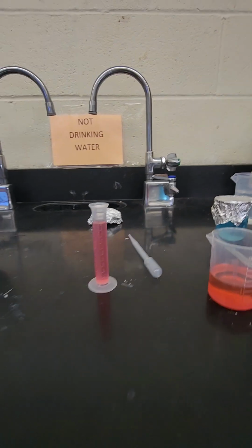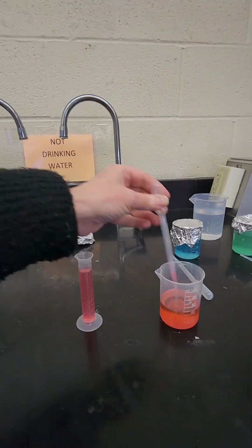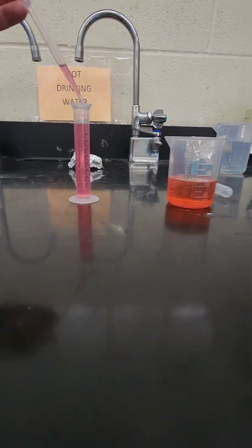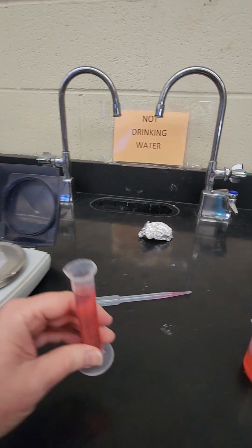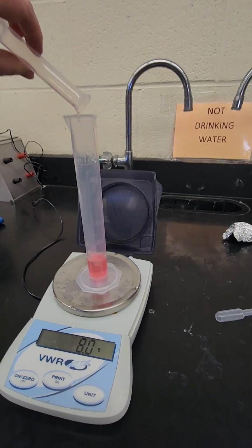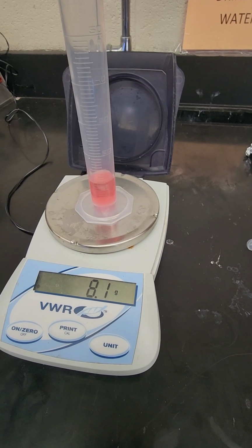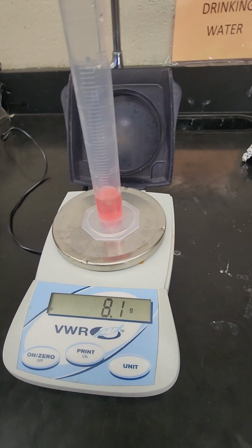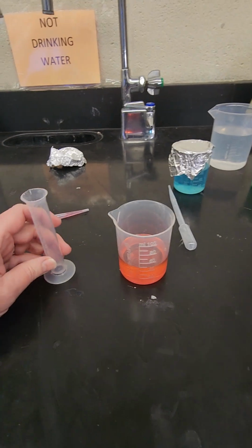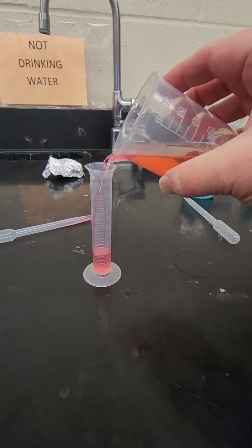Once I am sure this has 10 milliliters in it, again getting eye level to make sure, I'm going to add a little bit to get to where 10 is based on the meniscus. Then I'm going to pour it into the graduated cylinder. I'm going to write down the mass of the first red liquid at 10 milliliters, and the mass is 8.1 grams. I'm going to repeat this process until I get to a total of 50 milliliters in the graduated cylinder.